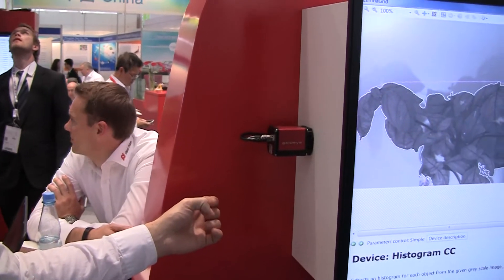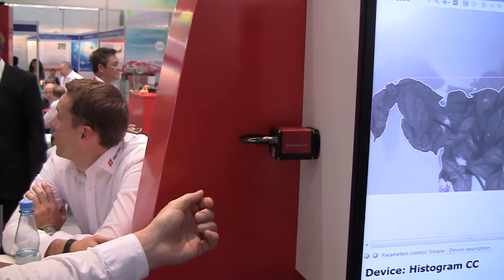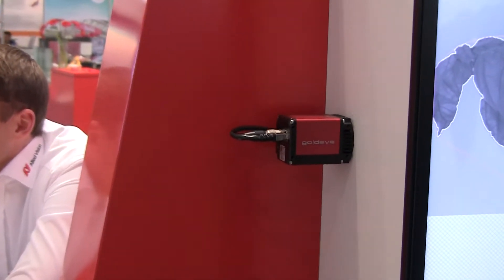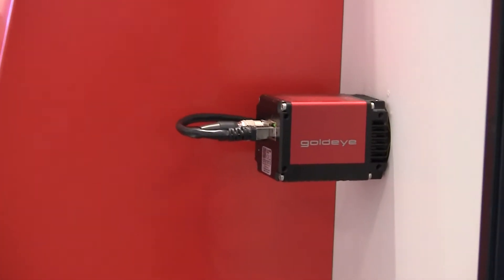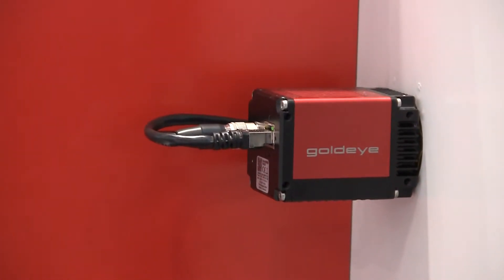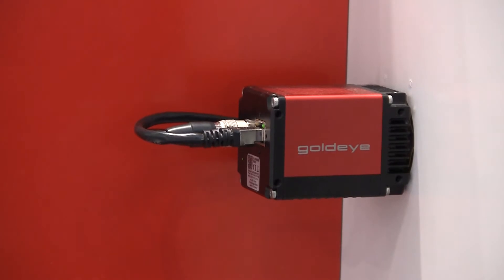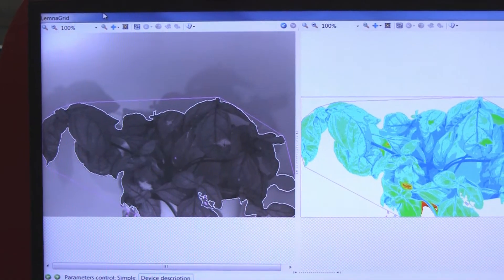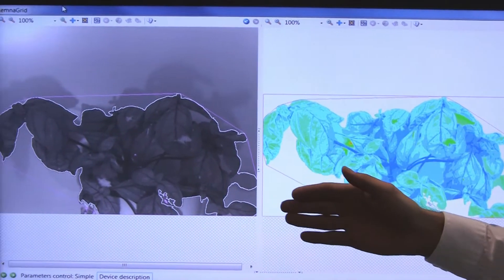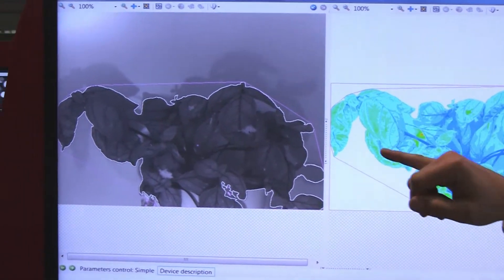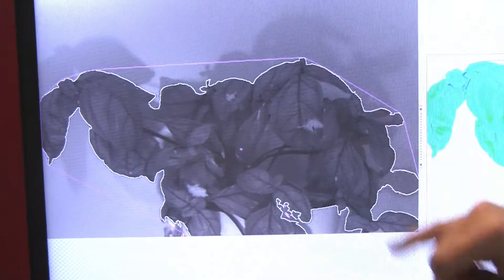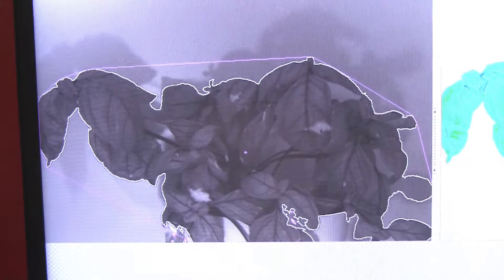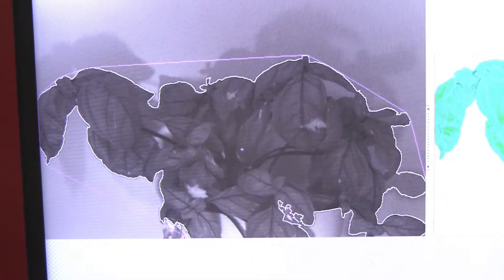This application we're showing here at the trade show uses a shortwave infrared camera, the GoldEye, to detect the water content inside a plant from 1450 nanometers to 1500 nanometers. This example shows an original image — the light areas in the leaves show areas of drought inside the plant, while the darker areas show more water content.